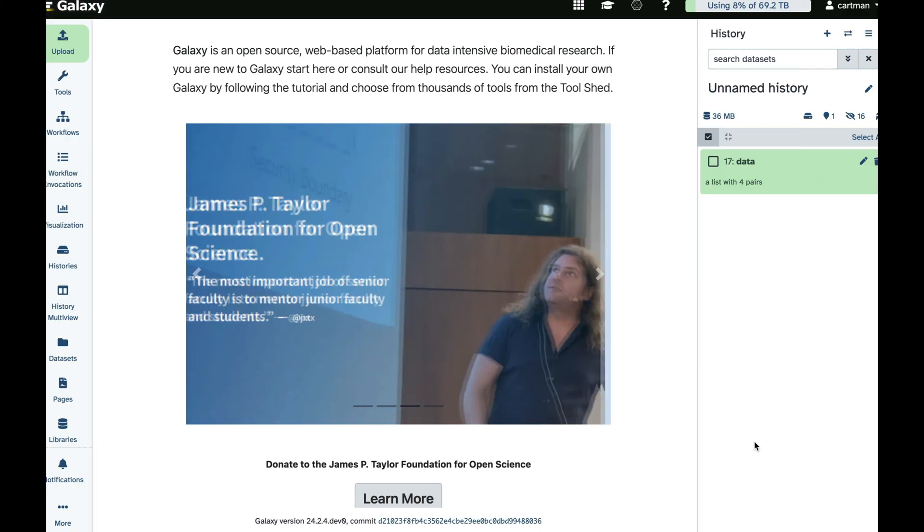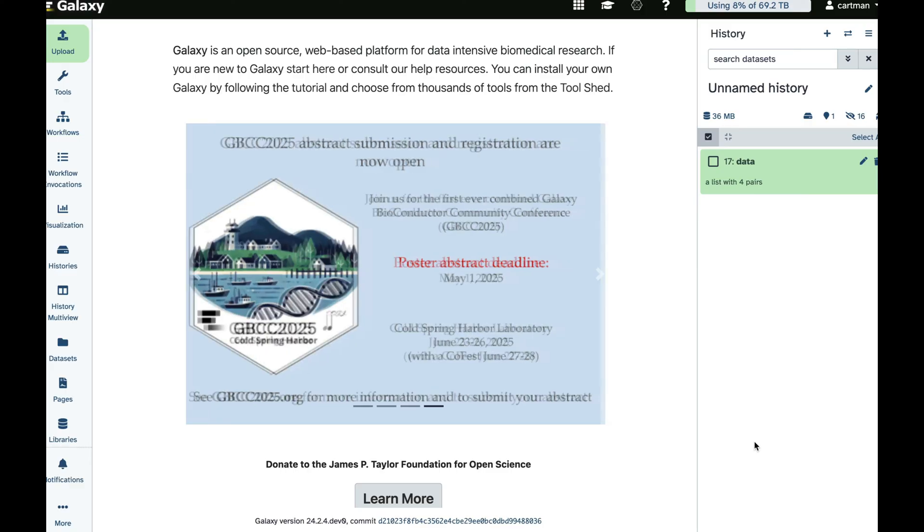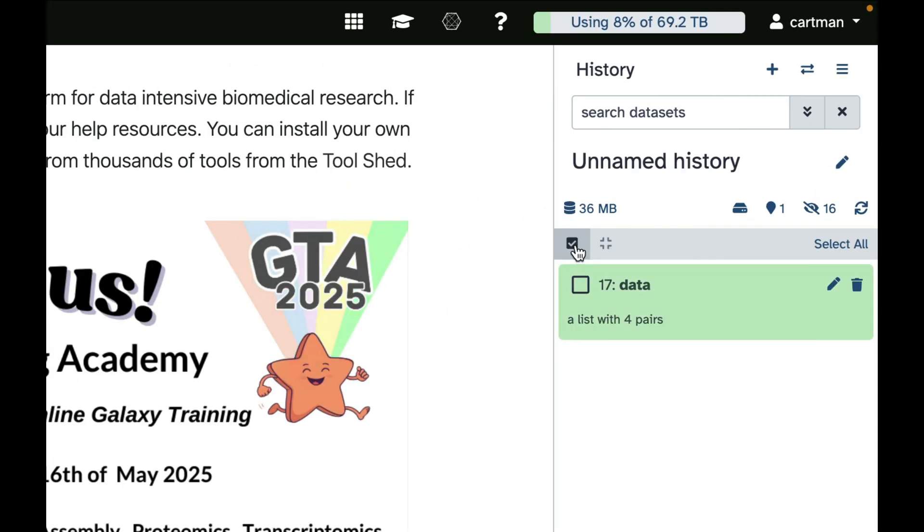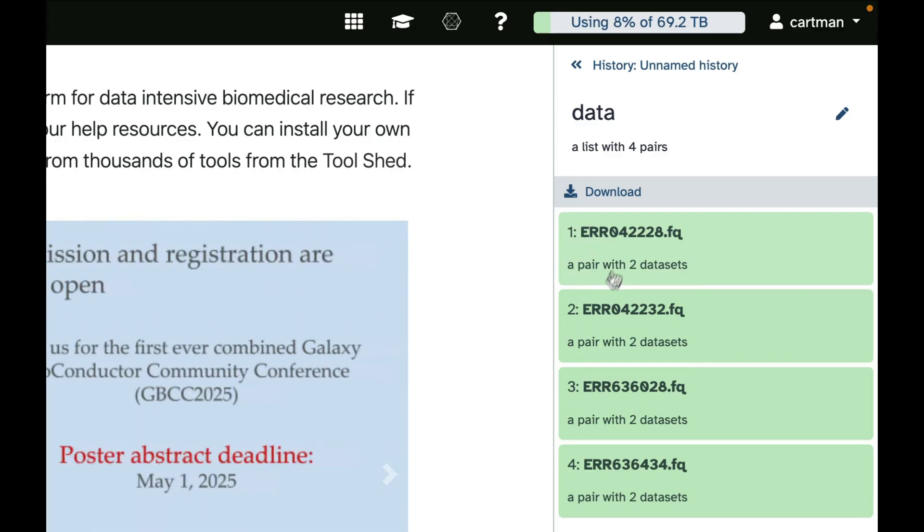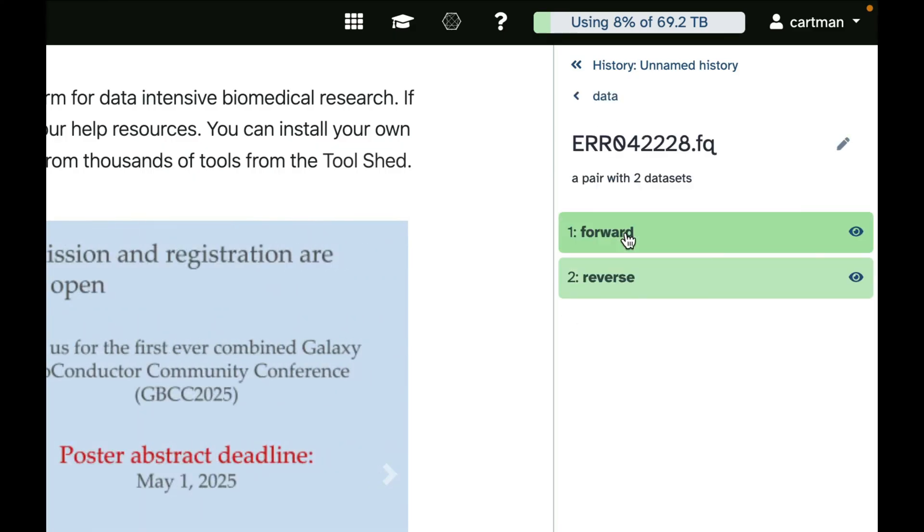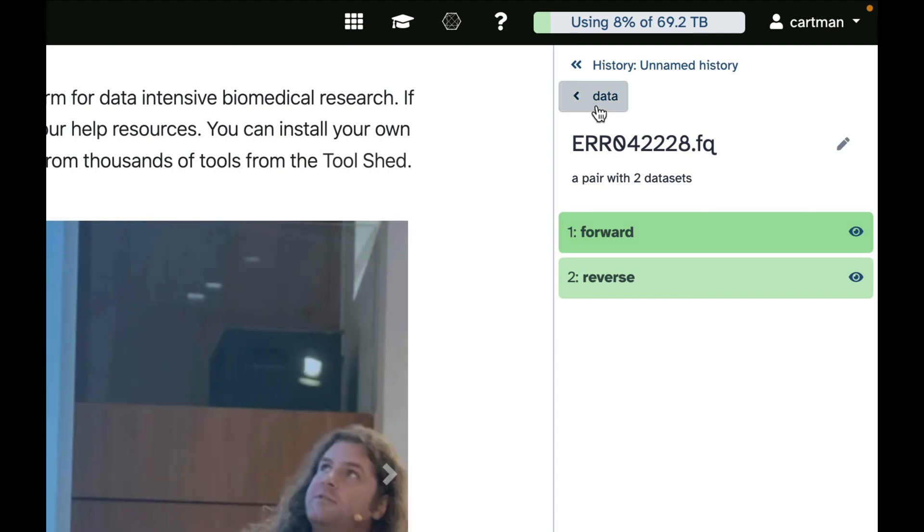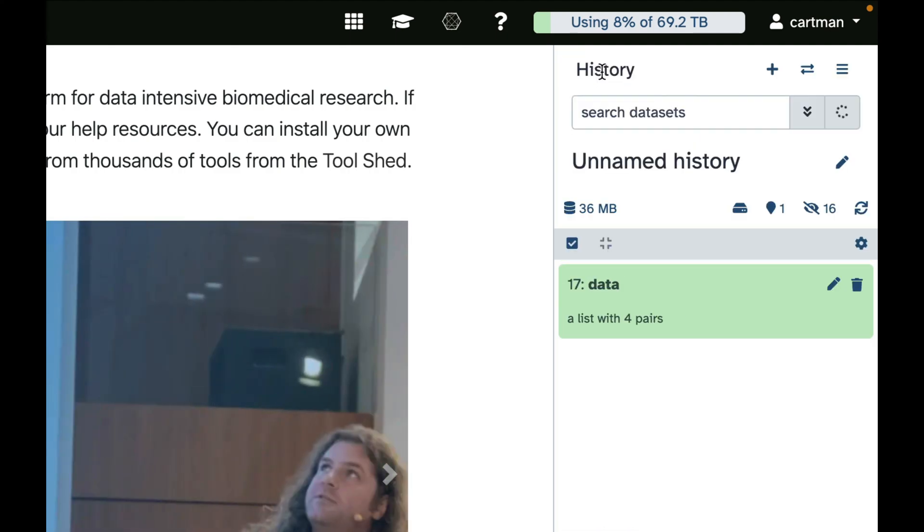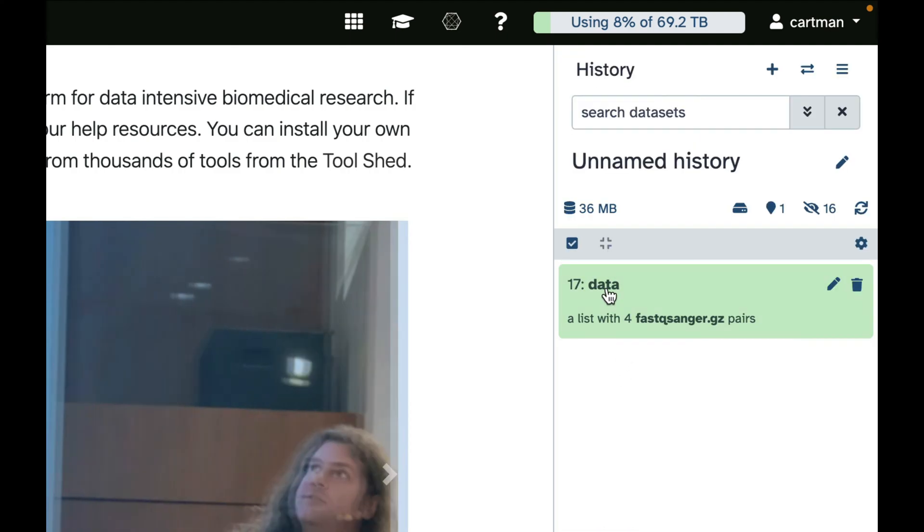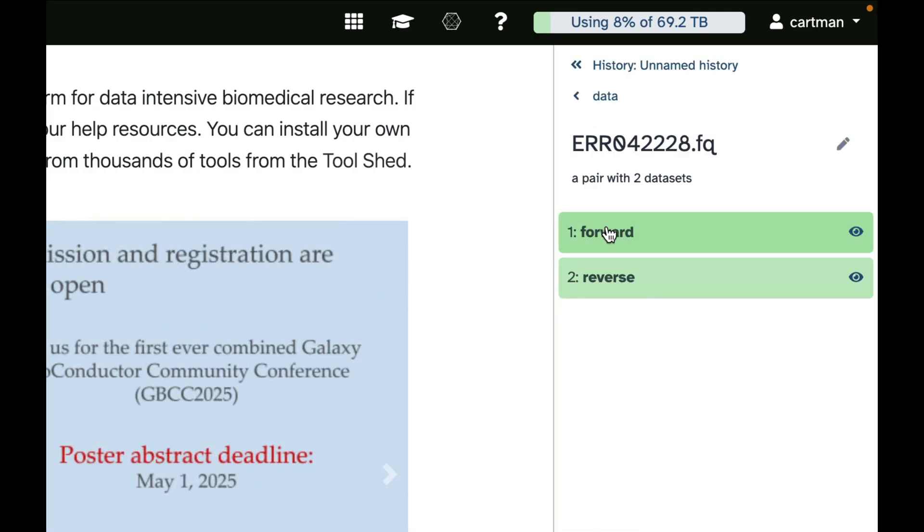You can see that the original data disappeared. Well, it didn't get deleted, it just became hidden. But instead you have this collection, and if you click on it, you will see it has four samples. And if you click on each sample, you will see it has forward and reverse reads. So it's a nested collection. It has two levels, really. The first level is the level of samples. The second level is the level of forward or reverse reads for each sample.